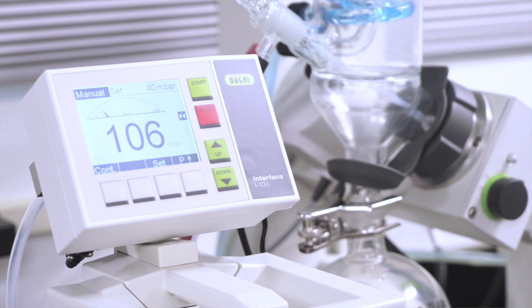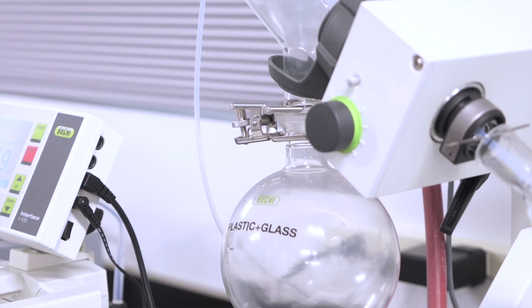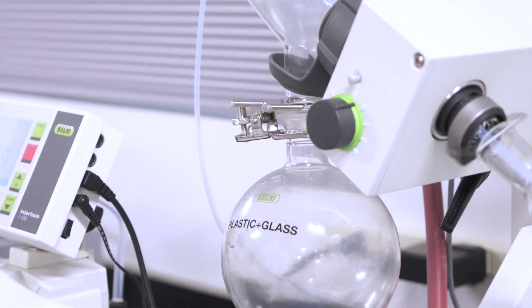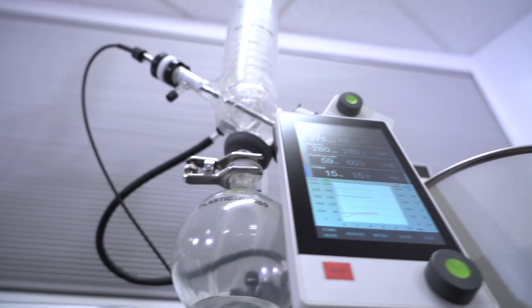The I100 interface serves as a vacuum controller but cannot control other parameters. On the R100, each variable requires interaction on the respective peripheral.